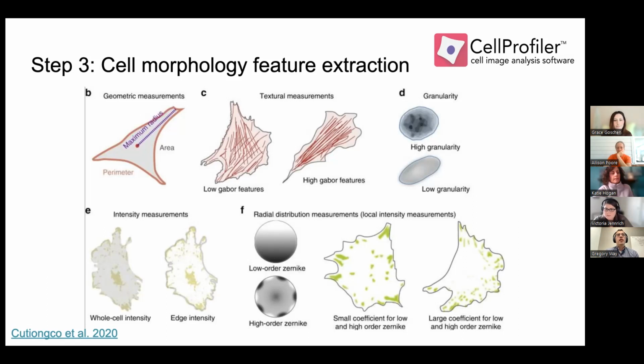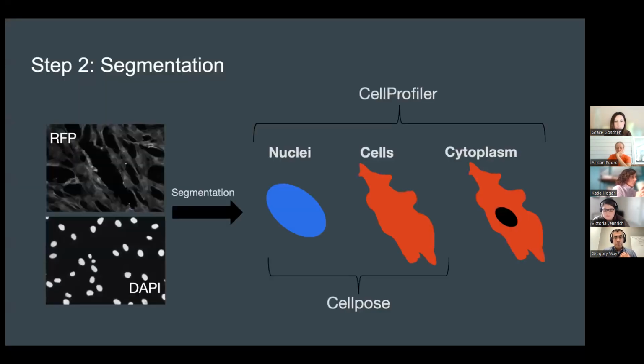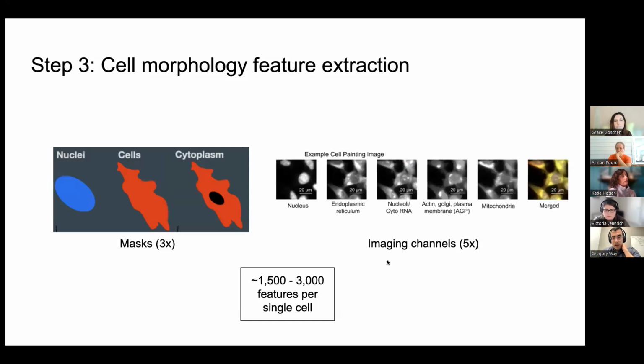Oh, maybe there's a question. Yep, Grace has a question. Great, yeah, thanks. So back on that slide about the subtraction, I'm just curious if you perform that subtraction on the nuclei so that you get a clearer look at the organelles. Is that essentially why? Yes, exactly. So if I go maybe, yeah, here. That's exactly right.